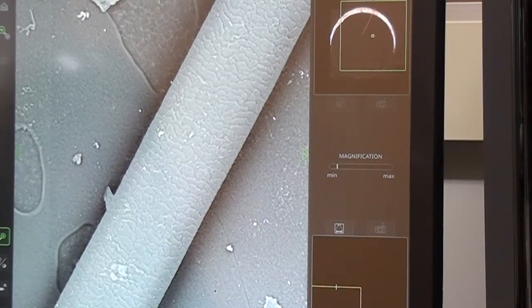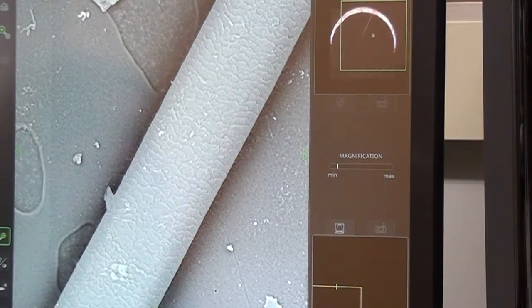For a STEM camp that we run and for the sake of our students, we put a human hair in the scanning electron microscope in order to demonstrate zoom and the kind of resolution that you can get with one of these machines.